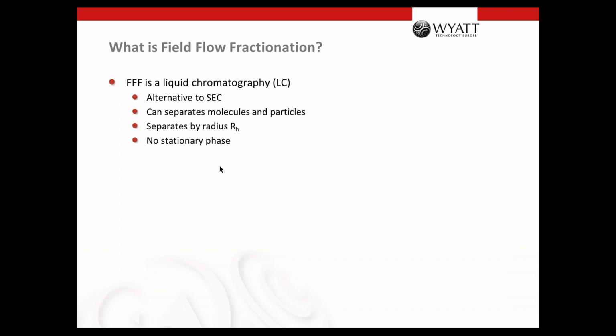So first of all, I want to explain what field-flow fractionation is. It is a kind of liquid chromatography. You can use it as an alternative method to SEC, as explained, and it separates molecules and particles. The separation relies on their size, so that means the hydrodynamic radius or diffusion coefficient. The separation does not take place in a stationary phase, so it's a stationary phase-free separation method.